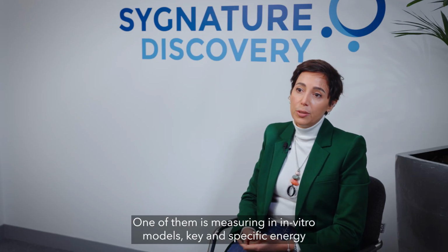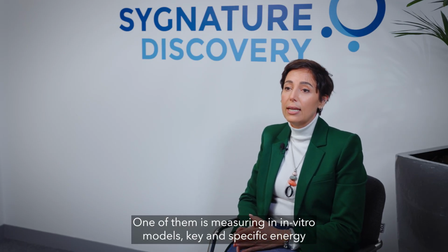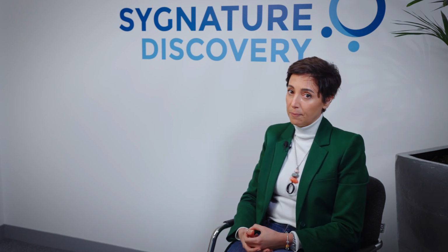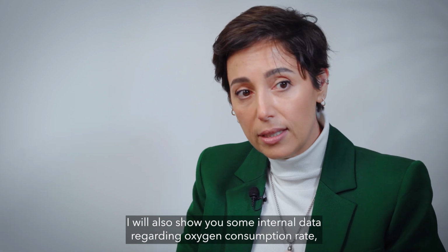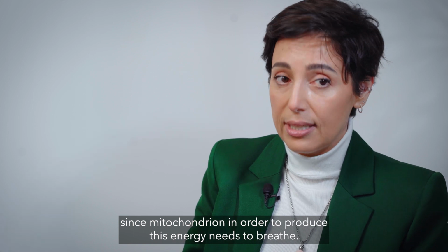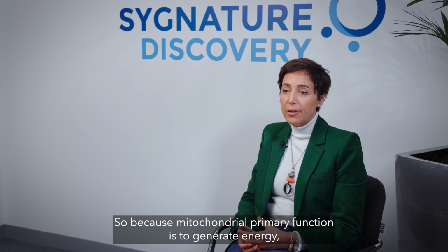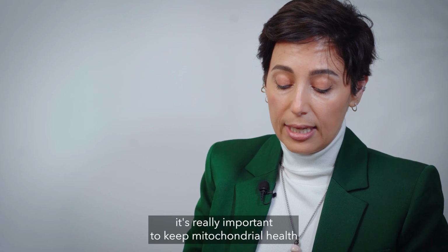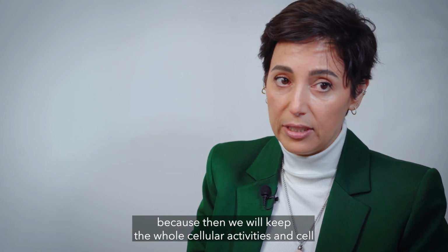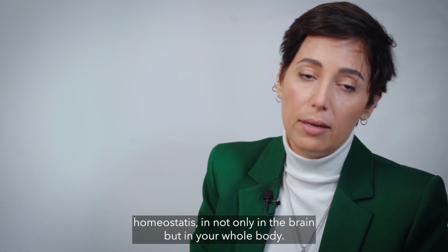One of them is measuring, in in-vitro models, key and specific energy metabolites related to keeping the cells with energy, such as ATP, ADP, NADH, pyruvate, and lactate. I will also show you some internal data regarding oxygen consumption rate, since mitochondria, in order to produce this energy, need to breathe. Because the mitochondria's primary function is to generate energy, it's really important to keep mitochondrial health, because then we'll keep the whole cellular activities and cell homeostasis, not only in the brain, but in your whole body.